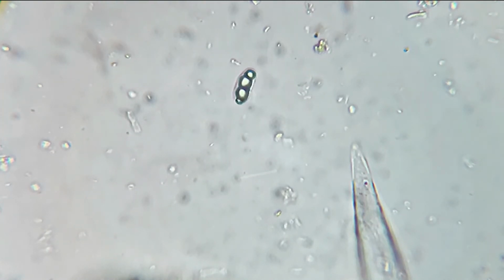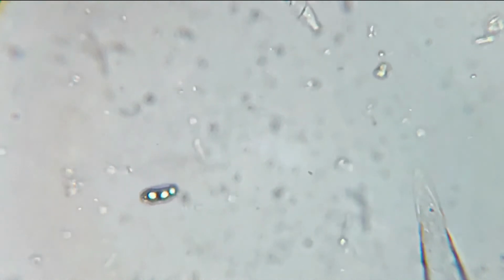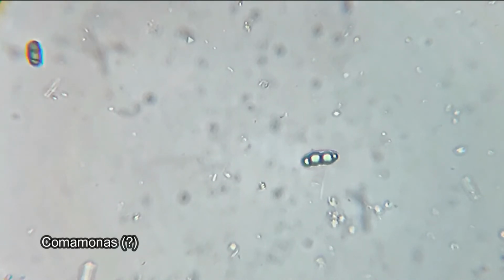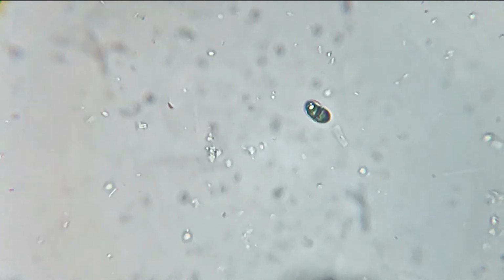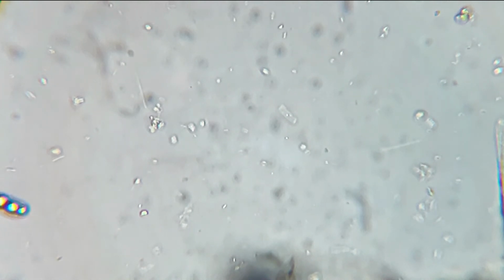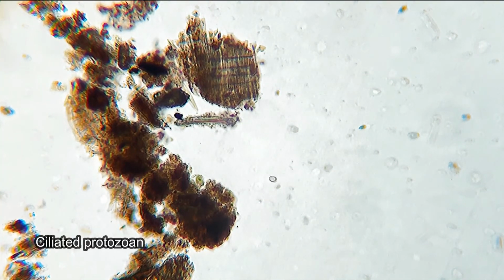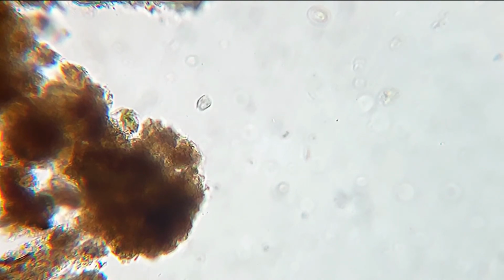I believe this is a species of bacteria that is pretty big and that is called Comamonas. Anyhow, I'm just truly mesmerized at the amazing, elegant way that they move. Check out the speed of movement of this tiny protozoan. Quite amazing to see how fast it bounces around.